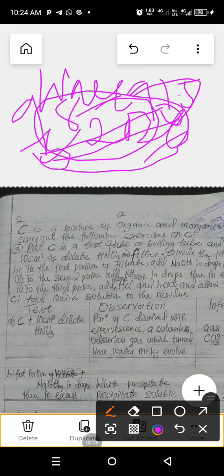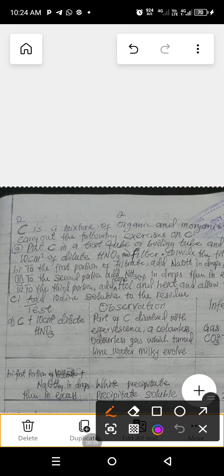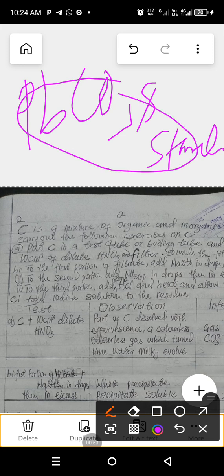2026 again. All right, so recall that WAEC 2026, they gave lead carbonate, lead(II) carbonate, and starch. Yeah, these are the salts given. So we're asked to mix in equal ratio 1:1, one spatula of this and one spatula of this, thoroughly mixed. Now, from research, lead carbonate is insoluble in water. Starch is also insoluble in water.